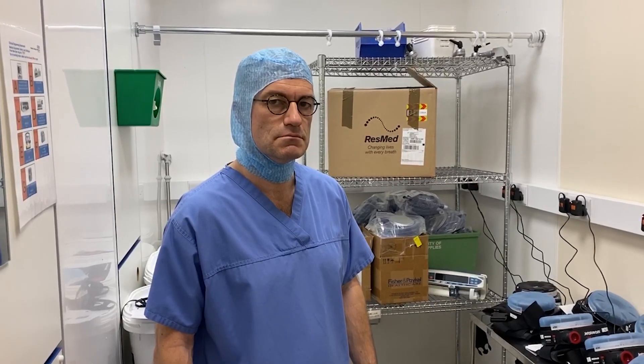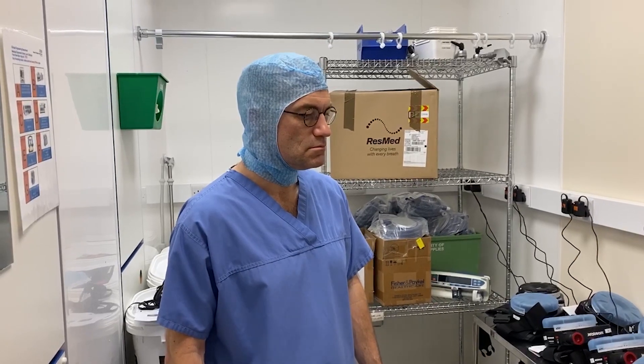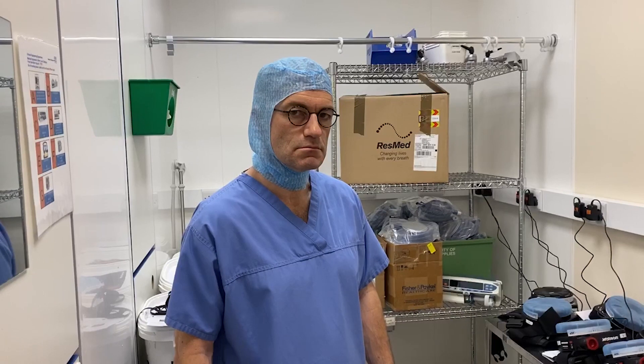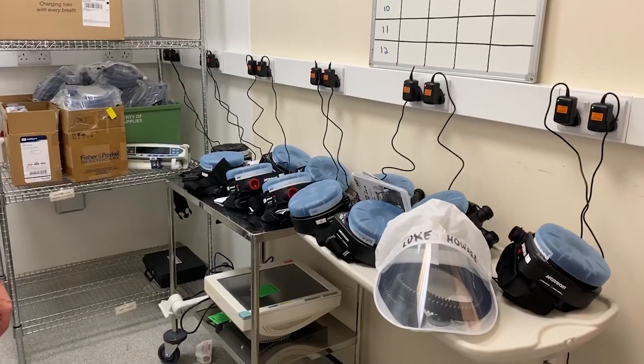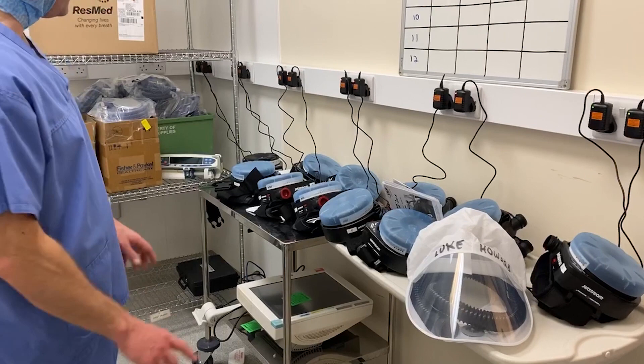This is a video about another sort of face mask to go into the CPAP ward. Luke Howard, thanks for showing us how to use this. What is this technology, Luke? So this is called a Powered Air Purifying Respirator, or PAPR for short.